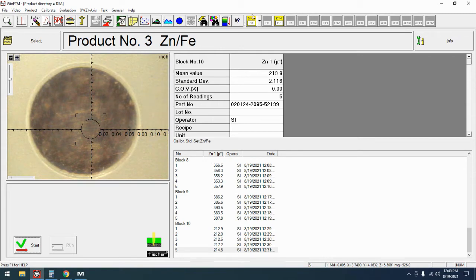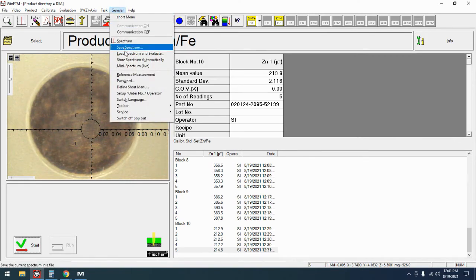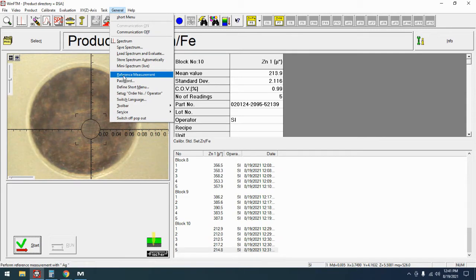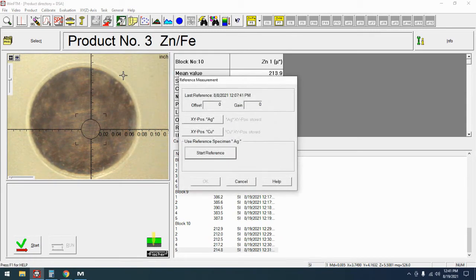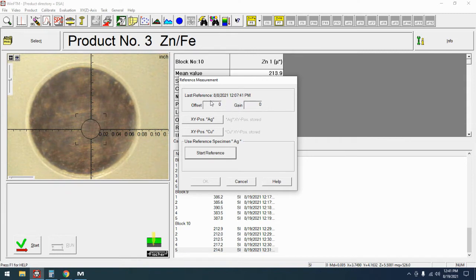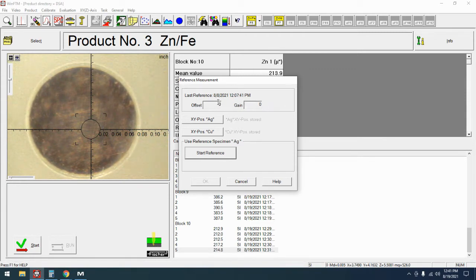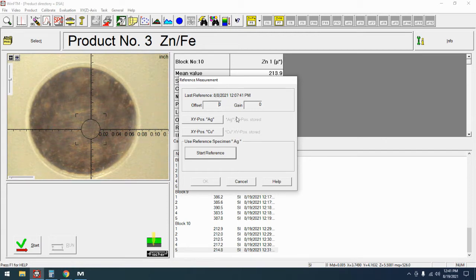So now we come up to the general menu and if we come all the way down here to where it says reference measurement that'll bring up the reference measurement dialog box. A couple things to note, first off it's going to show you the last time that a reference was done and any kind of offset or gain that was done the last time. For the most part these offset and gains and sometimes there is a voltage as well depending on what version of FTM you're using, but usually these two to three numbers are only important to a technician and they can help to dial in and diagnose any problems.